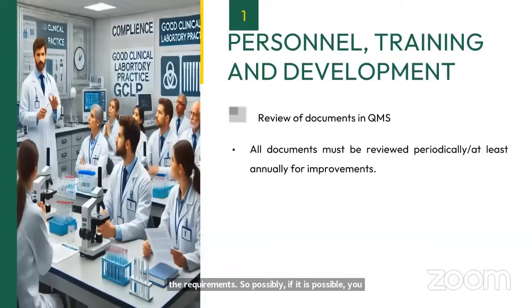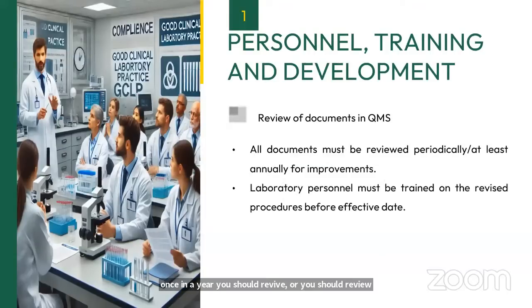Now, review of documents. All the documents must be reviewed periodically. As per the GCLP guidelines, at least annually for improvement. Periodically means whenever there is a change in the guidelines, whenever there are any changes in the parent document, then you should revise your documents in your laboratory also, or at least once in a year you should review those documents. So as per GCLP guidelines, they have given a specific frequency that at least once in a year you should revise or review all the documents.